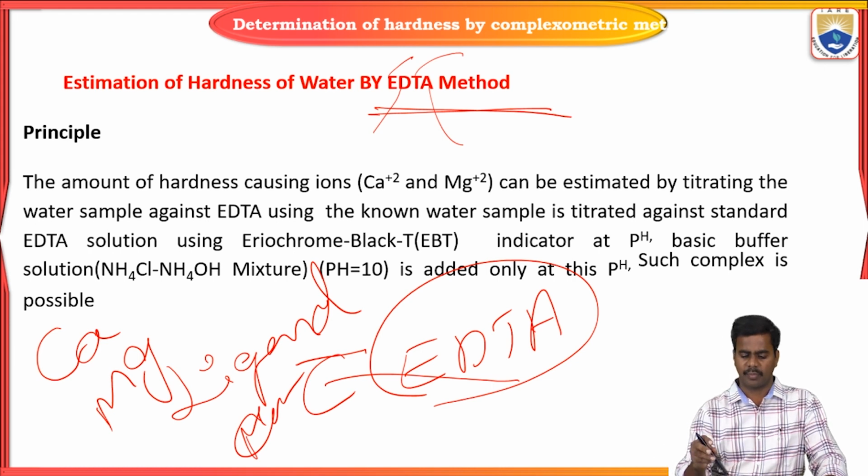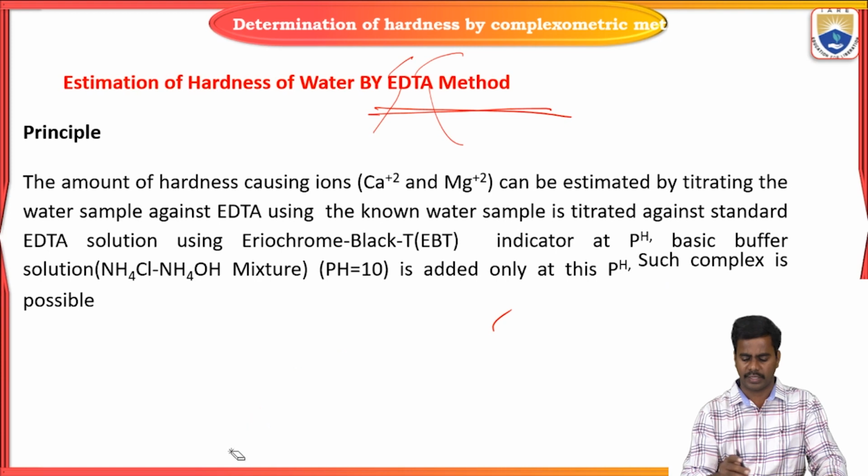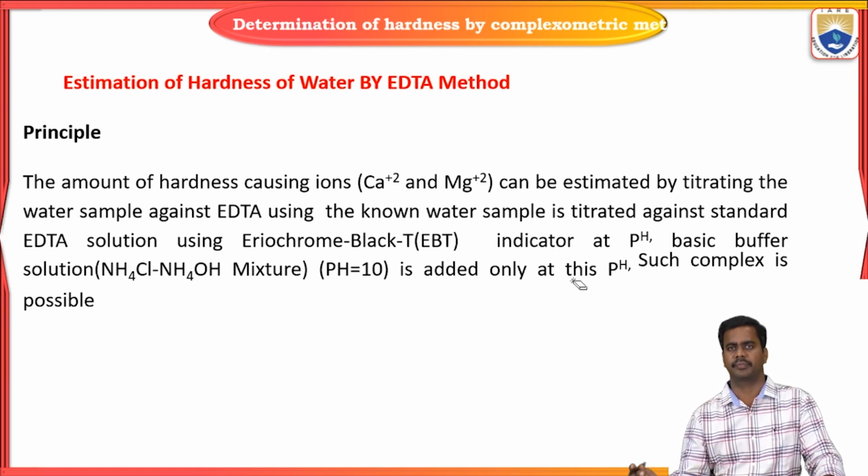Okay, next coming to the principle. Principle of the EDTA method. What is the main principle of the EDTA method?